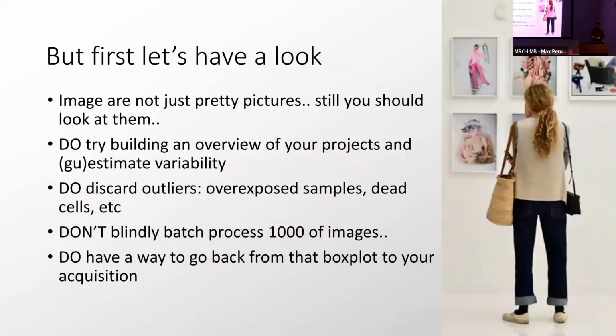So this is basically creating a workflow, and like this, we could just start and go define our analysis. But often, I find it good to stop before and have a look at the picture and try to visually grasp an idea of what's going on, because visually you can capture a lot and decide already if there is a chance of getting any information.